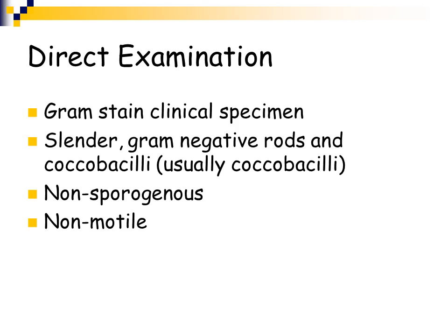That's especially done in cases of meningitis. We talked about that when we talked about Neisseria meningitidis, where you're going to commonly get cerebral spinal fluid in, and that is immediately a stat test, everything is dropped. You take your spinal fluid and usually spin it down so that you get any bacteria and cells that might be there concentrated. You take the concentrated pellet, make a slide, gram stain it and look and see what you have.